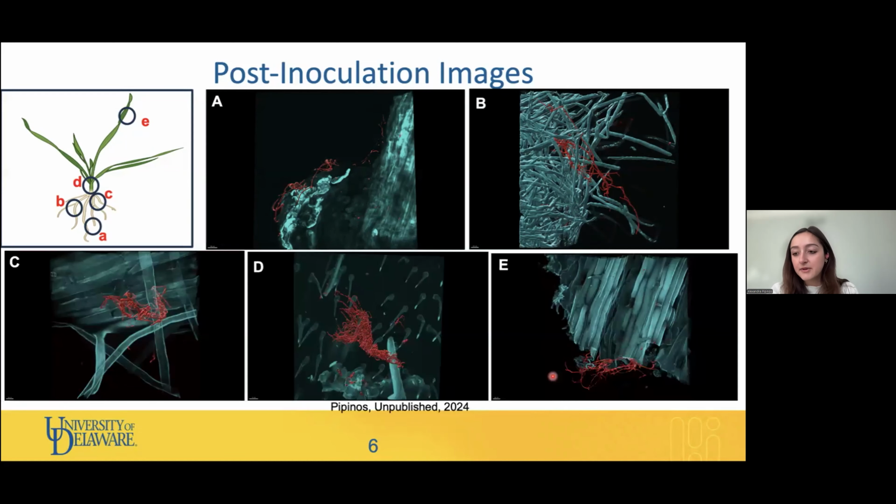And then next we have the maturation region, which is the upper root in image C. So this is a little bit more of a zoomed in image, but you can again see vegetative mycelia clasping to the mature root hairs of the plant. And then following the analyses of the root regions, we examined the root shoot interface. So this is also the internode.